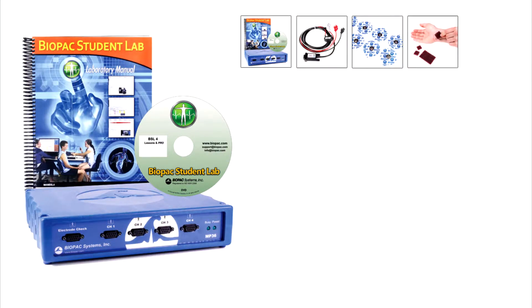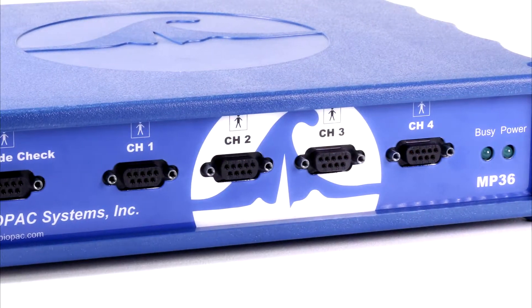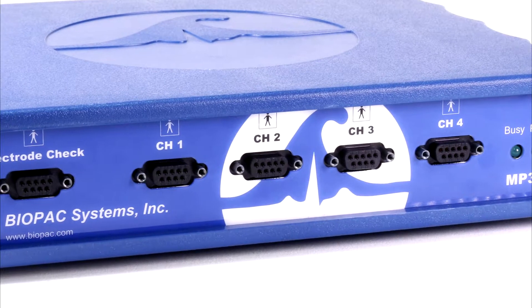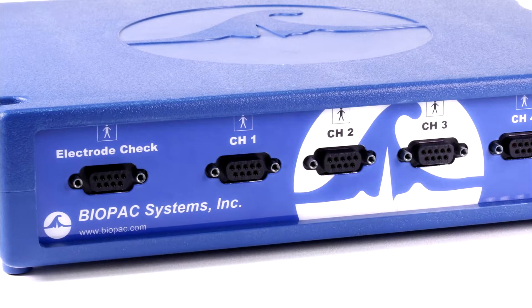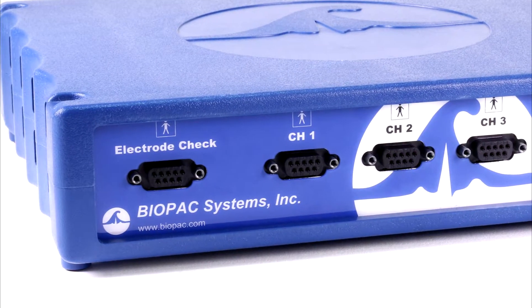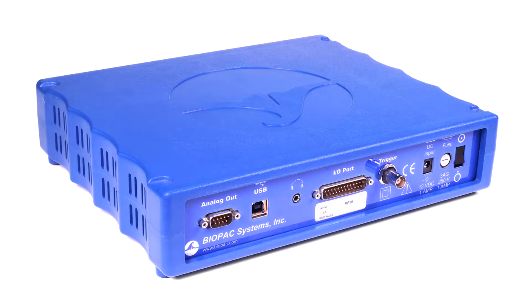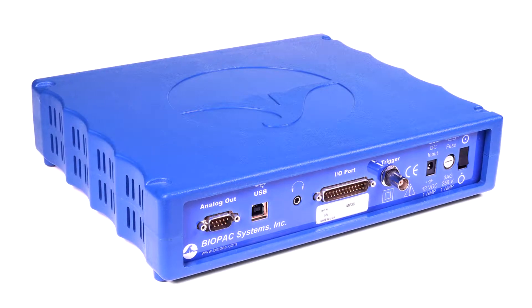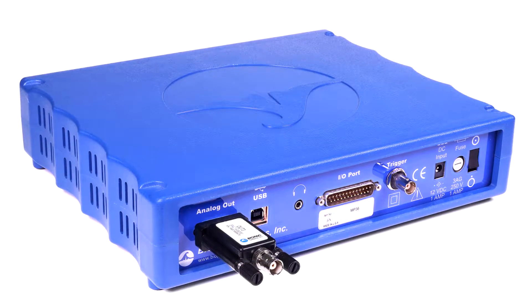The BSL basic system includes the MP36 data acquisition unit. This is the heart of the Biopac Student Lab system. With four universal analog input channels, data can be recorded from a wide range of signal sources including electrodes, transducers, IO devices, and stimulation. The electrode checker confirms signal quality before recording begins to help students collect good data. The MP36 also has a built-in low voltage stimulator for animal studies, accessible by adding the OUT3 stimulator output adapter.